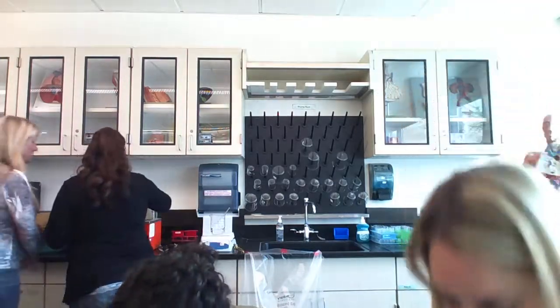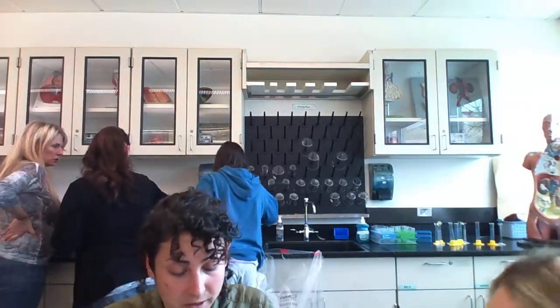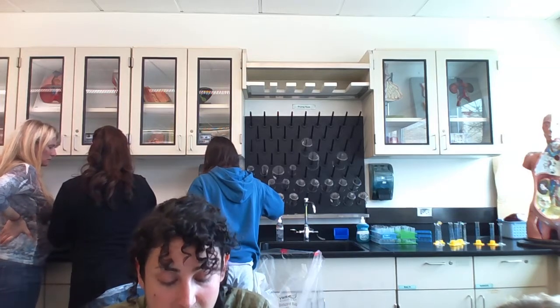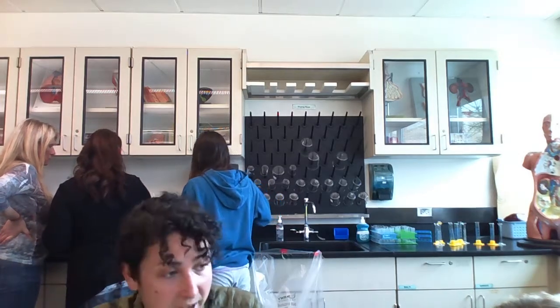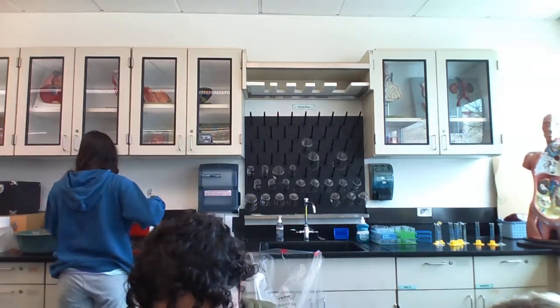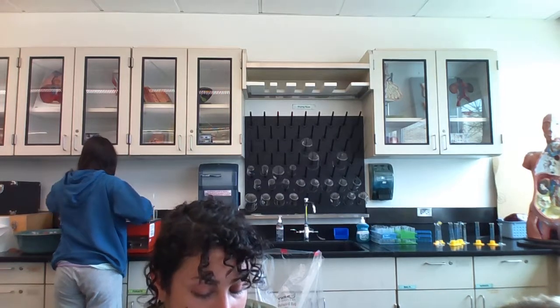Okay, so the fat that we're using here is a part of the litmus cream. That's what makes it cream. So you're adding cream to the litmus powder, and that has fat in it. And so the first 2, 1L and 2L, are the controls. So this is lipase without anything to actually break down because it just has water.